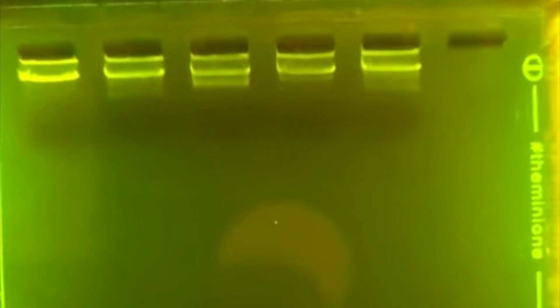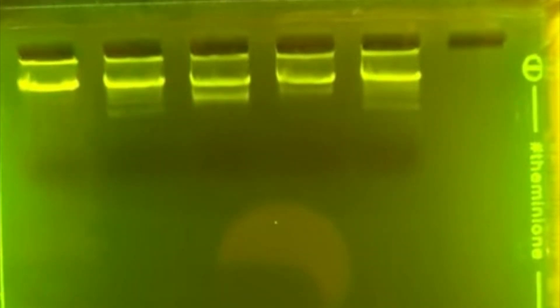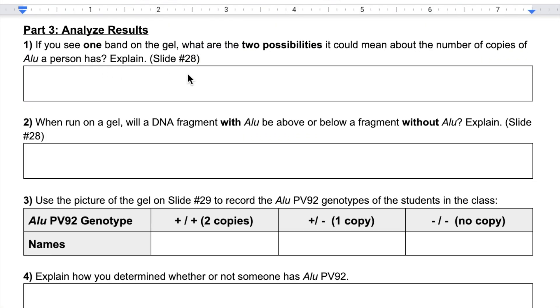DNA has a negative charge and will move toward the positive end of our gel box. One way we can then see the DNA is to stain it and, in this example, expose it to LED light. To see our sample results, we'll head back to our student guide and lesson slides.